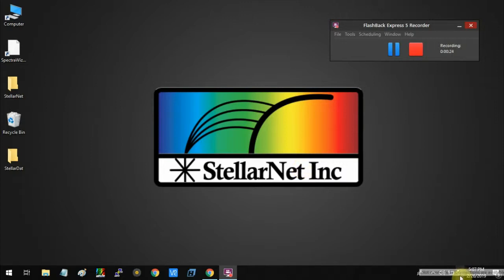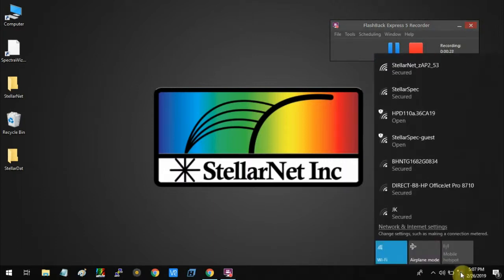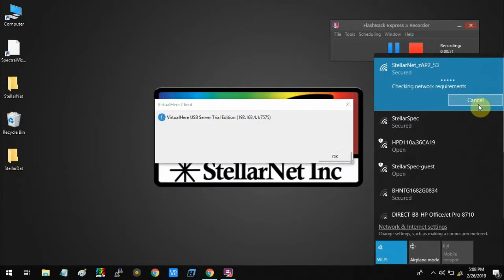First, you can connect your ZEP2 spectrometer access point, as you can see over here at the top. I'm just going to connect it like we connect to a regular Wi-Fi network. One thing we need to make sure is that your ZEP2 is connected to the same network as your computer in order to connect it successfully through the access point.